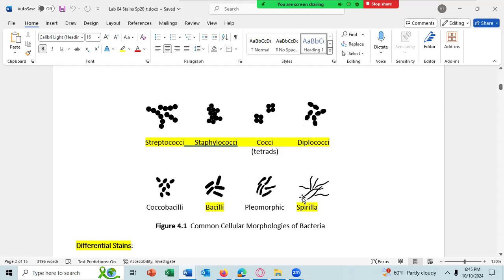With the spirilla, that's the S-type shape or the spirillum, the more bends in it, we normally only have singlets. So it's with the spirilla and the spirochetes that we only have singlets. And usually, unless you only have singlets, you will have a pleomorphic cellular growth arrangement, meaning you'll see more than one growth arrangement. And what you do is you name it by the highest growth arrangement you can see. Any question about any of that?